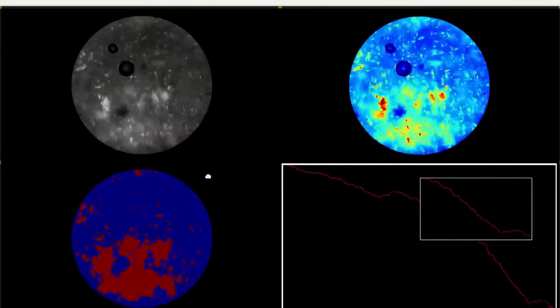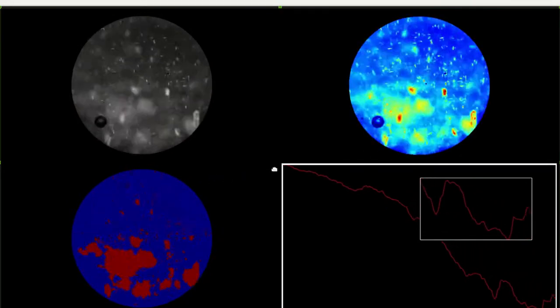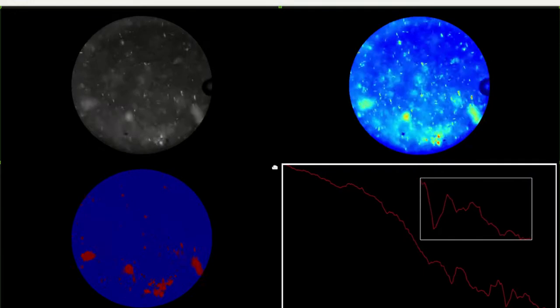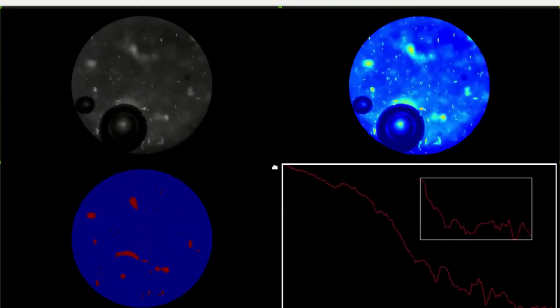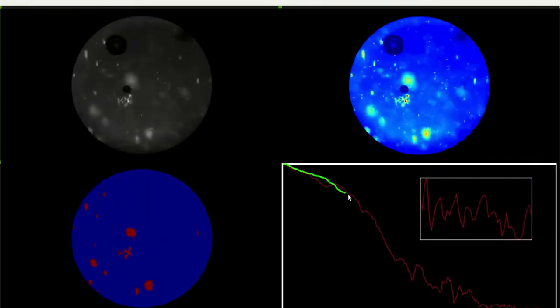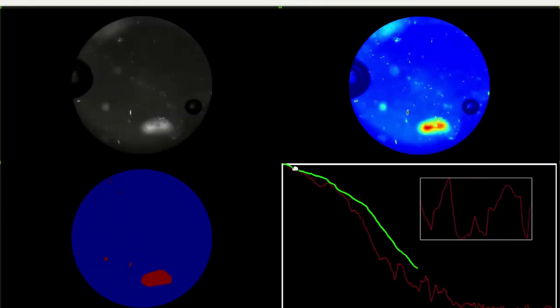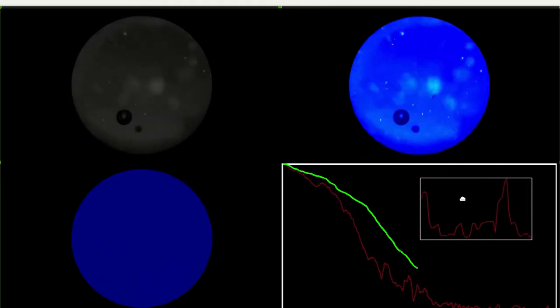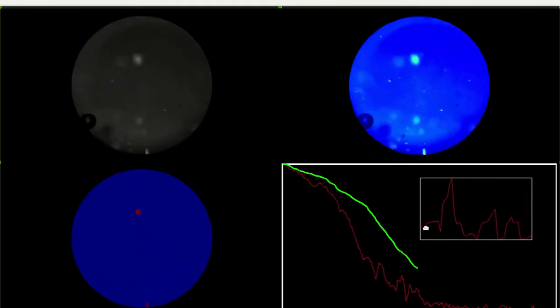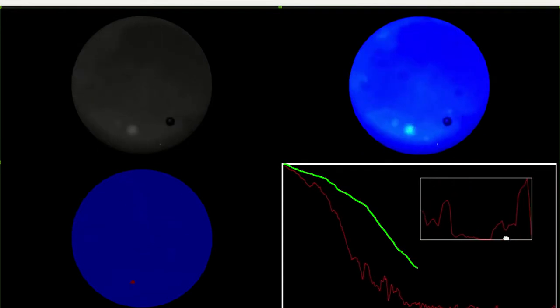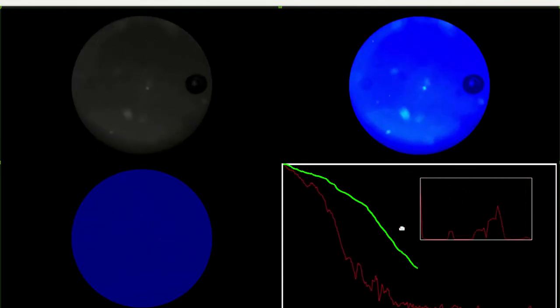The experiment starts out when the sample is cool and is gently heated. As you can see the viscosity decreases and the intensity that is measured by the Oculus decreases with time. The inset on the right is a moving window showing the last 50 data points recorded during the image analysis.